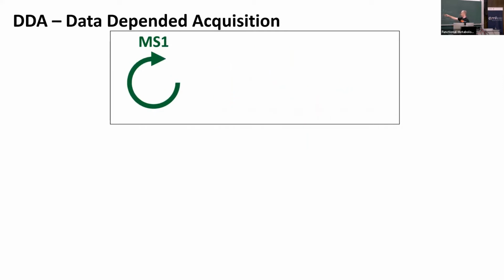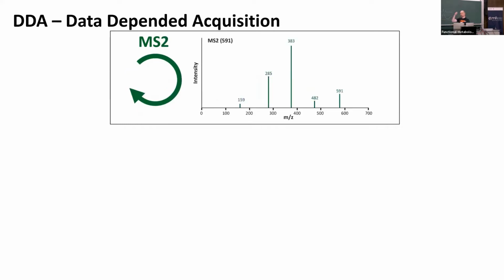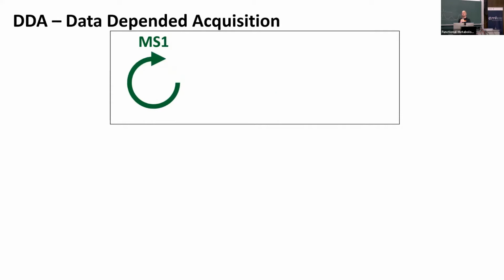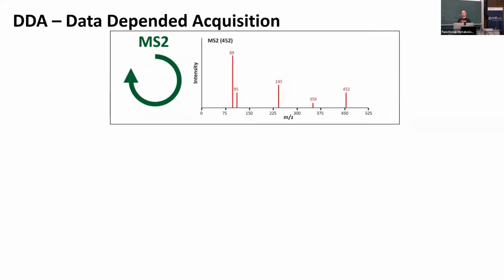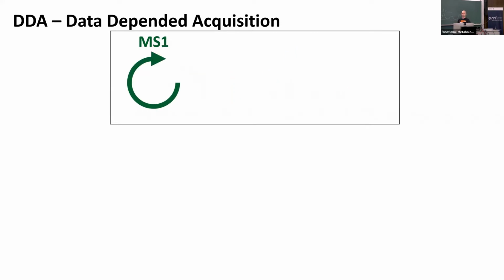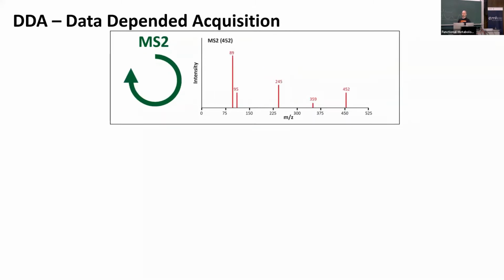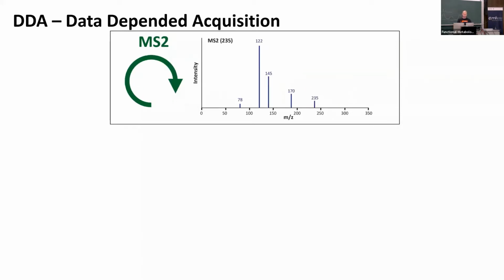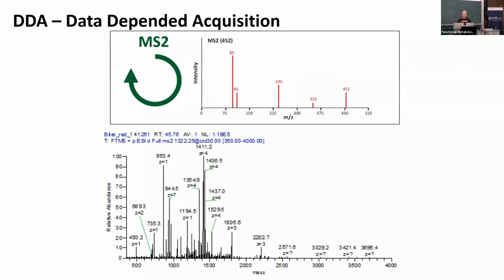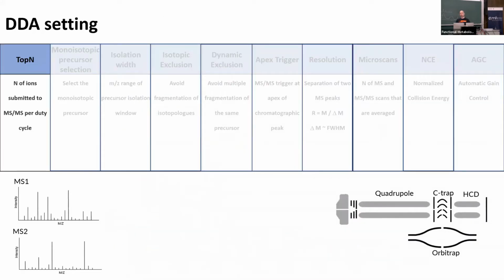And yeah, okay, we went a little bit into data points and chromatography and representation of peak shapes. But here, the speed and the number of data points is important if you want to do any sort of MS1 feature finding and peak picking or deconvolution. We can talk about that in detail in a second again, if there are still questions. So yeah, we generate a lot of MS. But how are we gonna set these settings up, right?